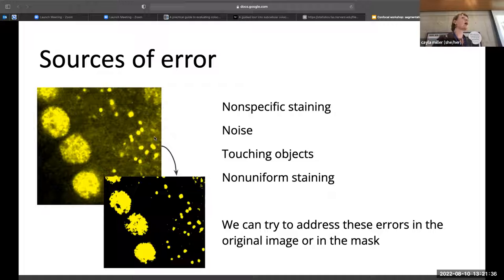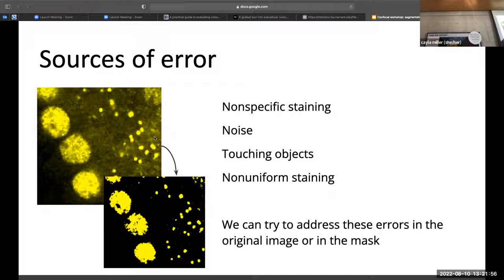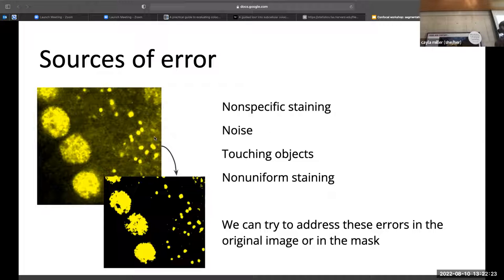Why are we even setting a threshold? We have an image with different intensity values, and by eye you can see puncta. If you want to automate the process or make it less biased and more high throughput, you need some way to identify where your signal is. We're going from our 8-bit or 16-bit image to a binary background/foreground where we distinguish what is puncta and what is background.